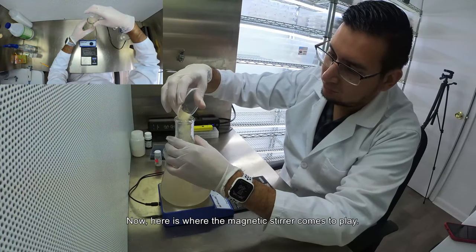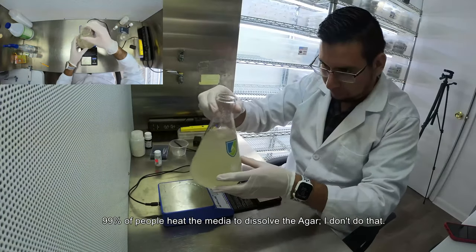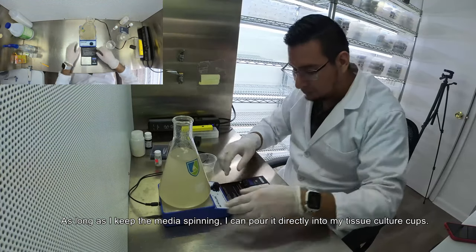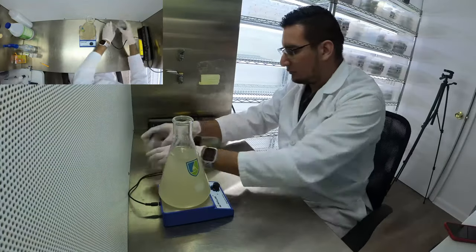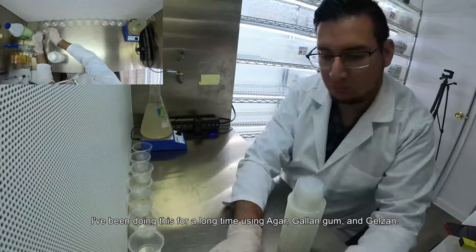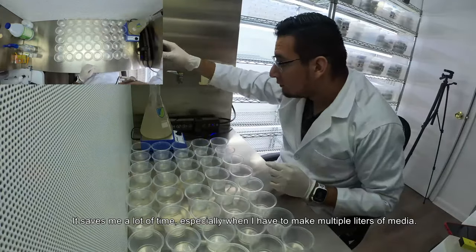Now, here is where the magnetic stirrer comes into play. 99% of people heat the media to dissolve the agar — I don't do that. As long as I keep the media spinning, I can pour it directly into my tissue culture cups. I have been doing this for a long time using agar, gellan gum, and Gelzan. It saves me a lot of time, especially when I had to make multiple liters of media.